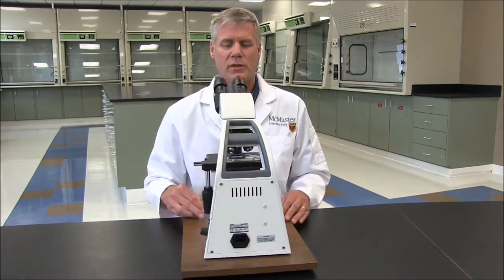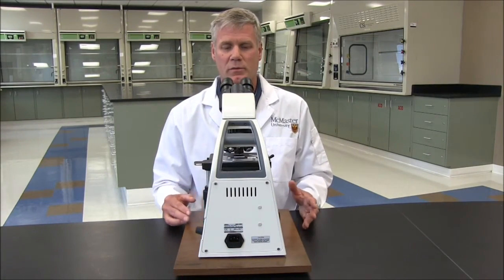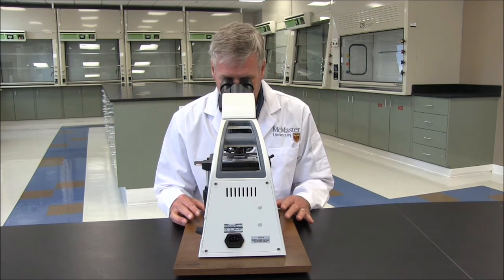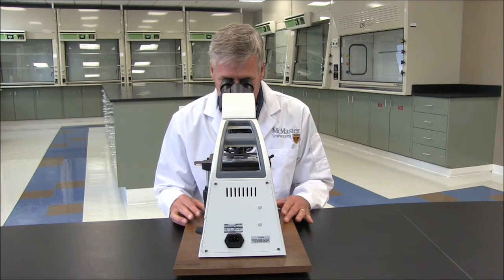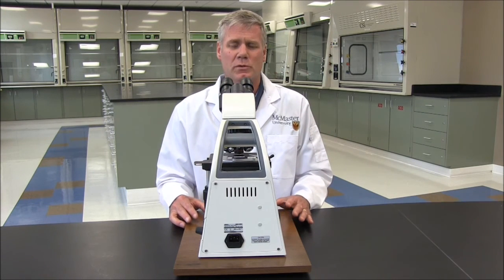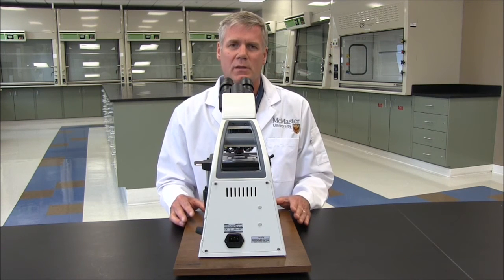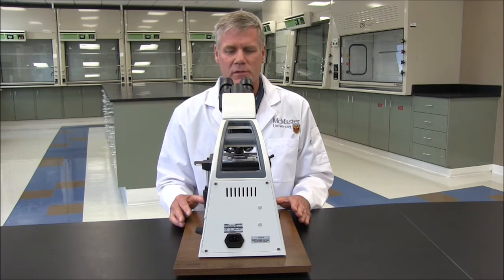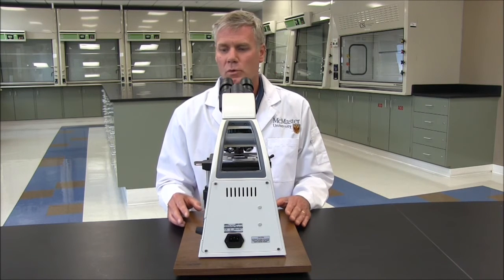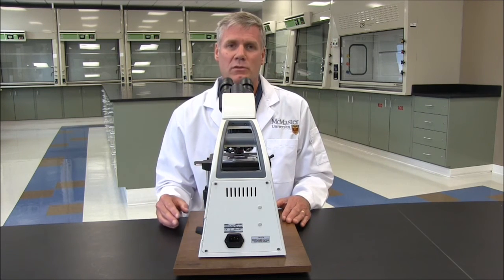When you first sit down at the microscope bench, you want to make sure that you adjust your seat height for comfortable viewing. Ideally, your head should come forward and both eyes rest on the eyepieces comfortably without moving your shoulders up or down. You could be sitting at the microscope for a while looking at different specimens, taking notes, or drawing objects that you see. So make sure that you're comfortable.